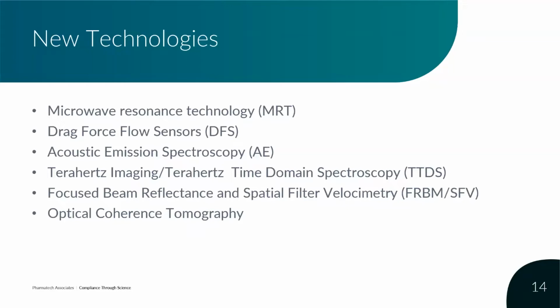Acoustic emission spectroscopy has been used in the past to quantify properties such as tablet thickness, mass, and other physical properties of the finished solid oral dosage form. Terahertz pulsed imaging and terahertz time domain spectroscopy have been shown to be very useful for monitoring the thickness of a film coating, as well as pore size in coated tablets, as well as granules. So these techniques use terahertz energy pulses, which I like to think of as far infrared.